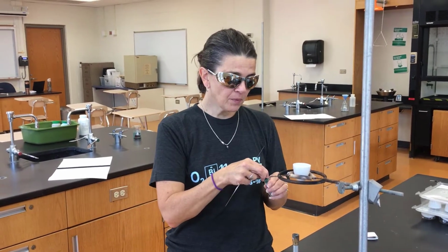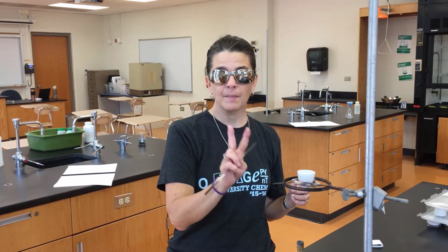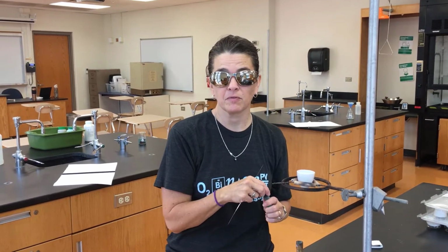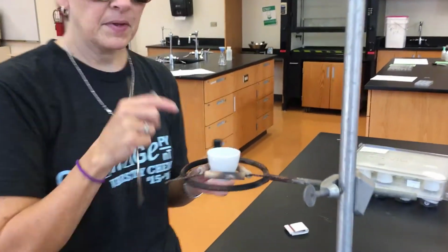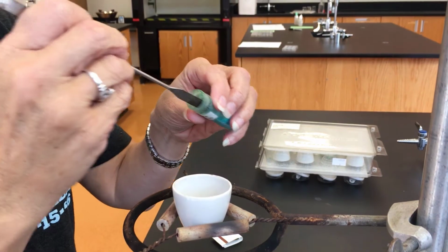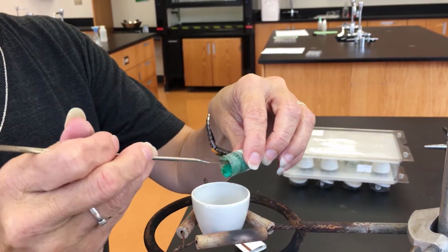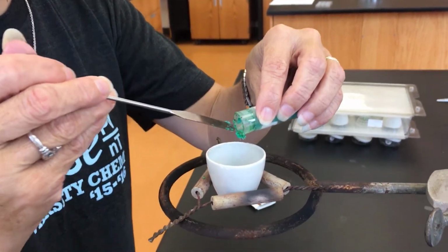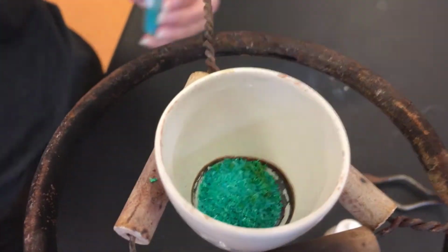So what we're going to do today is first heat off the water, then separate the copper and the chlorine from each other so that you can get separate masses, and then it's your job to figure out an empirical formula. Okay, you will be given the mass of the empty crucible, and I'm going to put some of my compound into that. And you will be given the mass of the crucible with the compound in it. You can see that lovely greenish blue color.